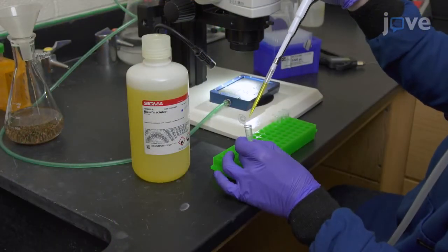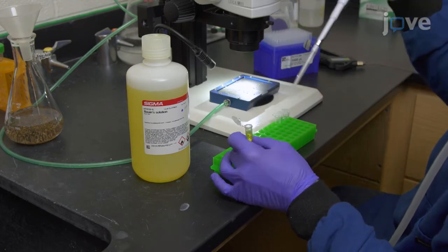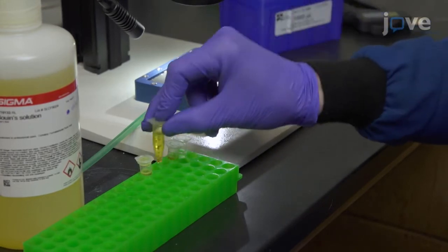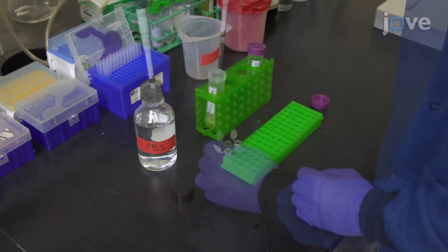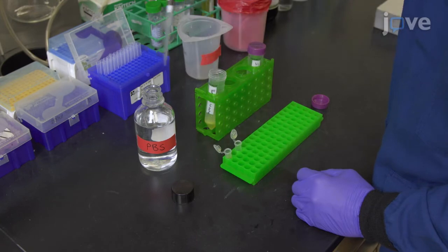At the end of the incubation, replace the PBST with 1 milliliter of Bouin's solution and tap the tube to fully submerge the flies. For larval and pupal samples, after a 2-hour incubation at room temperature, wash the animals 3 times for 5 minutes in 1 milliliter of fresh PBS per wash.